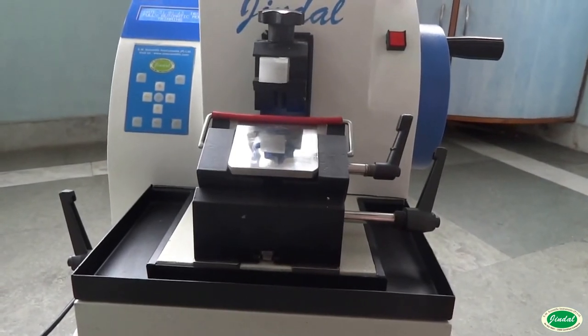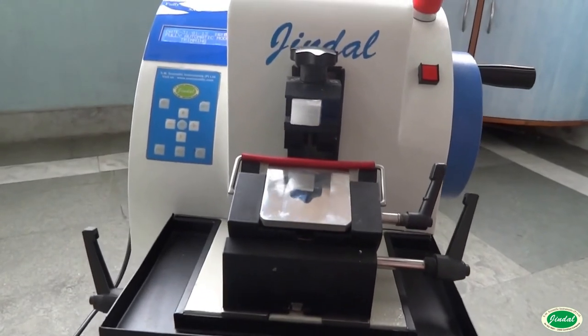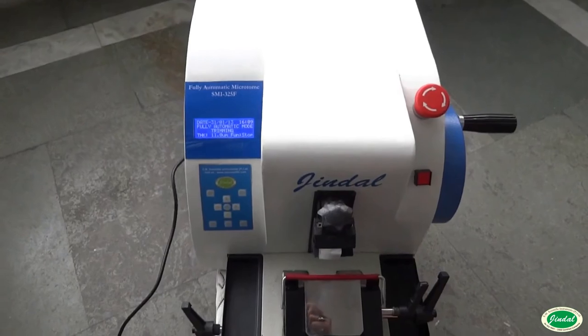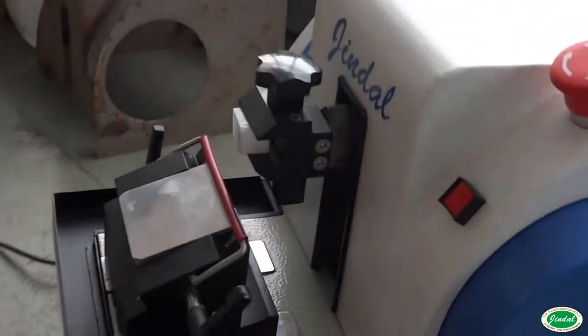The complete width of the knife can be used by using a straightforward blade fastening mechanism. Using the entire knife edge is cost-effective, particularly in laboratories with high specimen throughput.